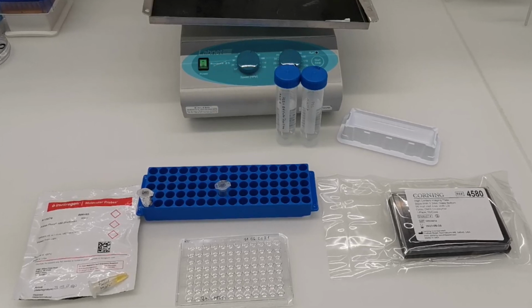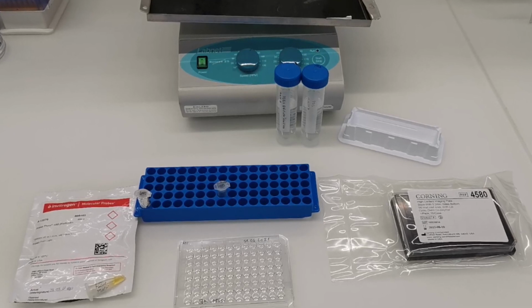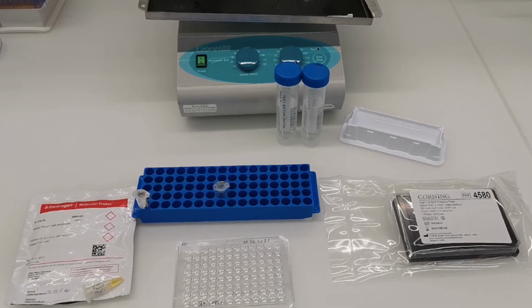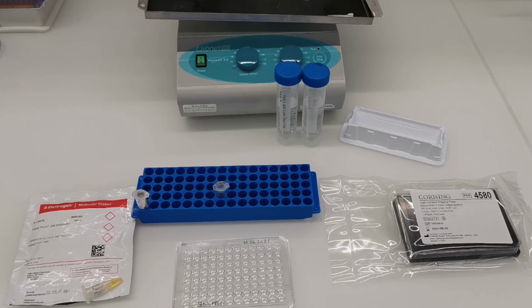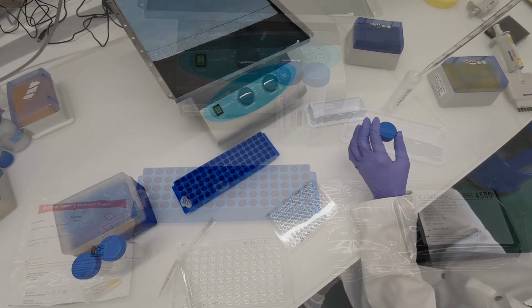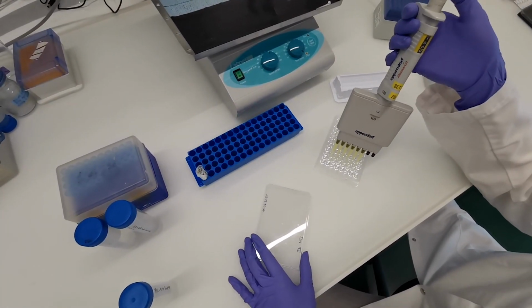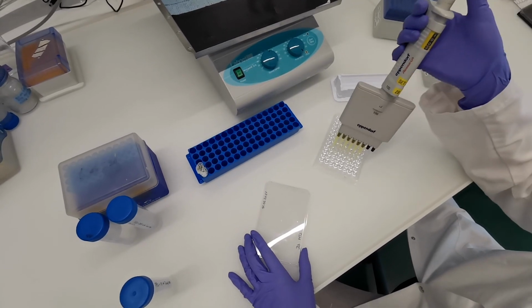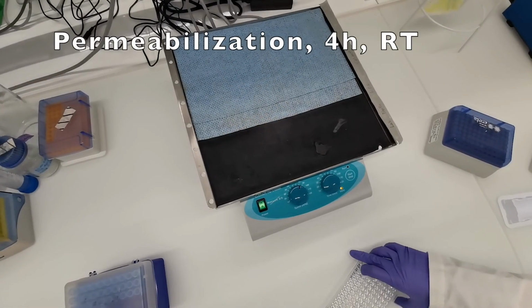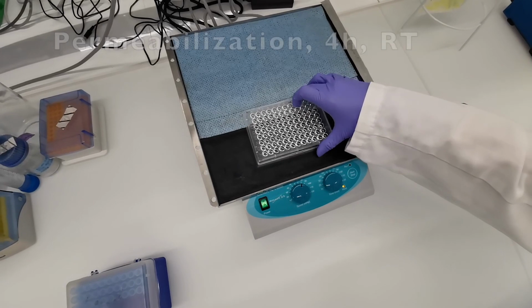The glass bottom plates offer excellent planarity for sophisticated microscopic analysis. Additionally, black plates offer an excellent signal-to-noise ratio. A rocker is also required for this process. Following the fixation procedure, which we have just shown, the microtissues are washed with PBS. Microtissues are then permeabilized for 4 hours at room temperature on a normal workbench, so again in non-sterile conditions.